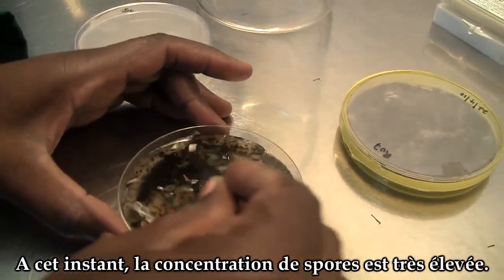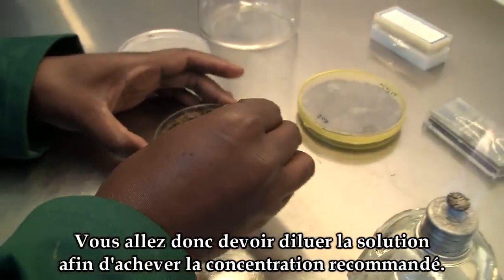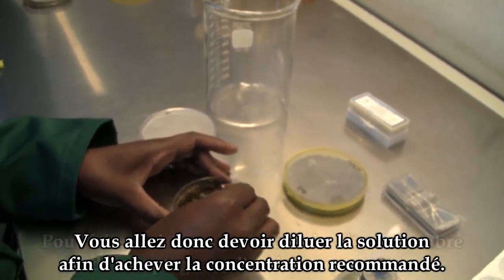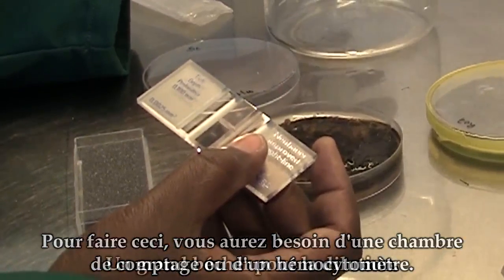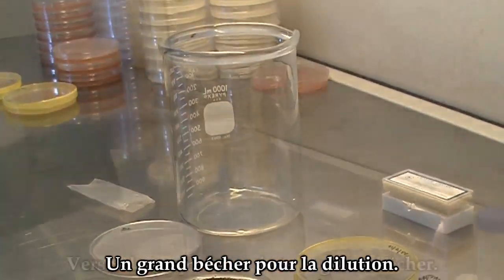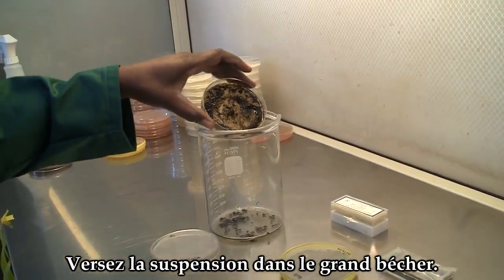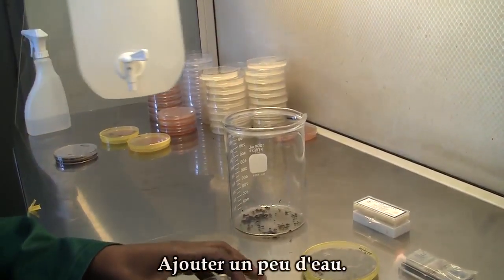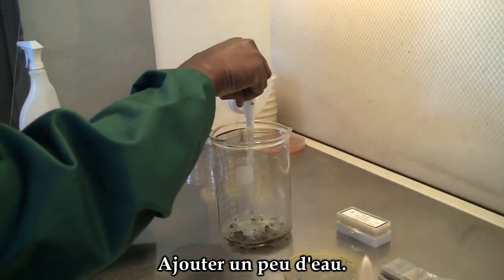At this point, the spore concentration is very high, so you will need to dilute it to reach the recommended concentration. To do this, you will need a hemocytometer or counting chamber and a large beaker to make the dilution. Pour the suspension into the large beaker and add a little water to make the dilution.